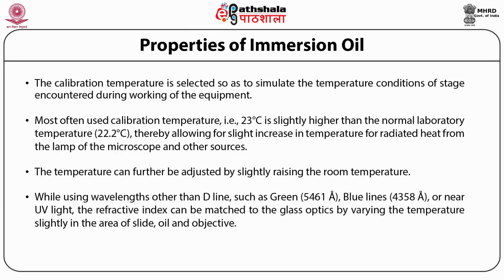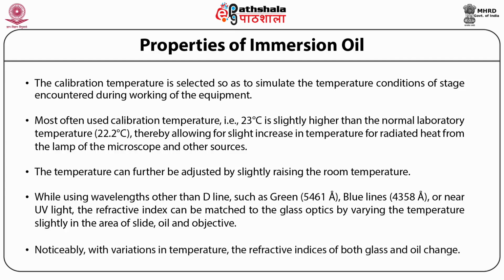This required change in temperature can be determined from the temperature coefficient and dispersion value. Noticeably, with variations in temperature, the refractive indices of both glass and oil change. Nonetheless, this change is negligible in solids and therefore can be neglected.